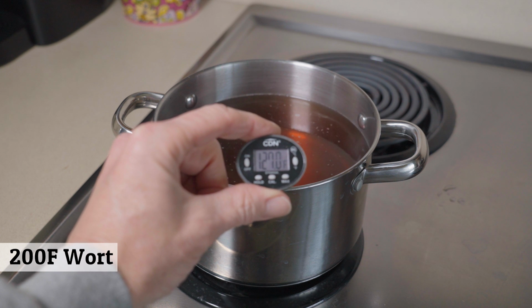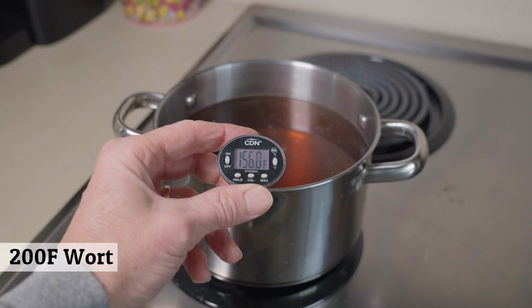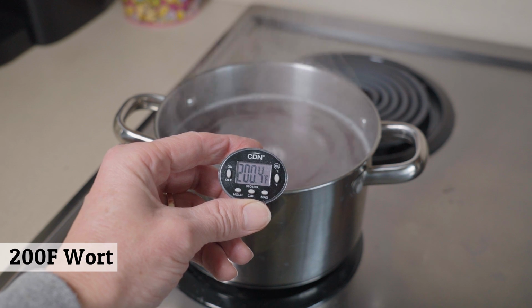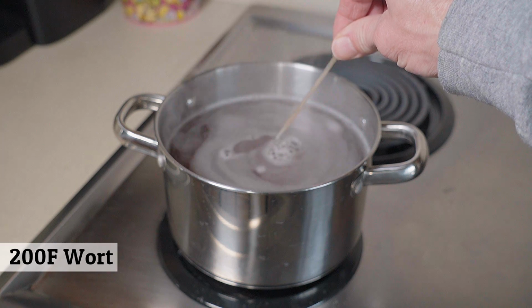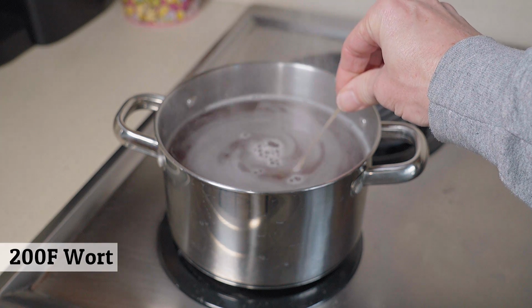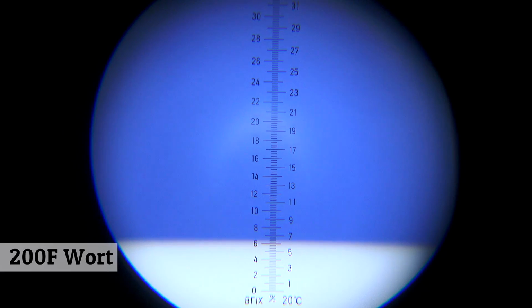Now we're at our highest point I'm going to do today. This is 200 degrees F, not too far away from boiling. This temperature would represent something you might take from your boil kettle right before you're committing to your boil schedule. So once again, we'll take our direct reading first. And we can see it's actually pretty close to the original.